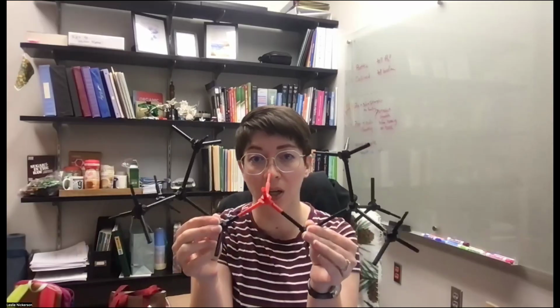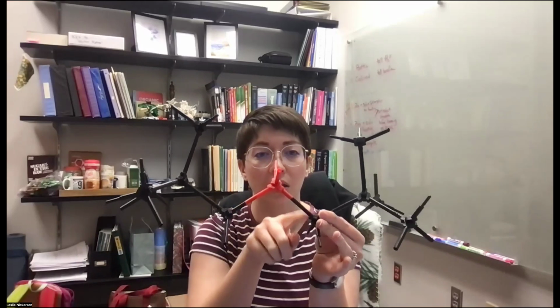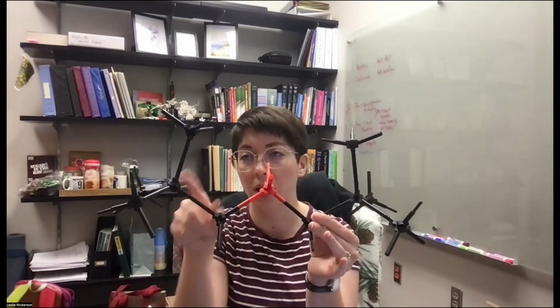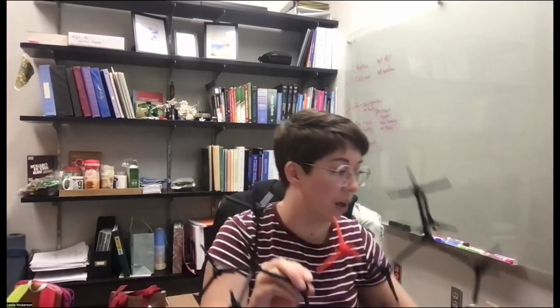So that's one thing that we need to keep in mind. Second thing is identifying planes of symmetry. So in this molecule, we've got a plane of symmetry right here, right? When we're looking at that, that means that this carbon is reflecting into this carbon, into this one, and then these 3 and these 3 are all in the same environment. Okay, so that's the planes of symmetry that we're looking at for that one.